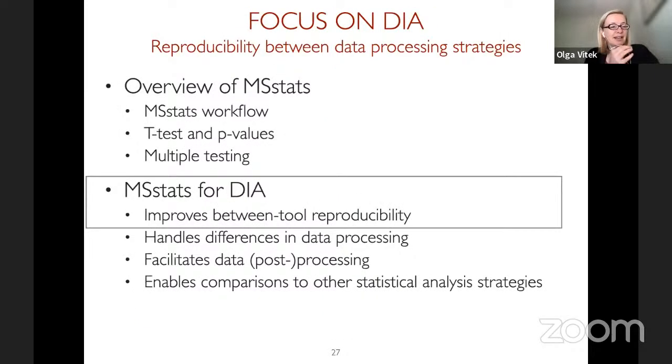So now we have half an hour left, and I can actually tell you a little bit about the methods implemented in MSstats, and there is a lot. Just like last week, when our speakers had to skip over many details, we will have to do that too. So I will just have a few vignettes which hopefully convince you that it's worthwhile working with specialized methods for our data, as opposed to some generic methods which are available in R or in Bioconductor or in Excel for that matter.